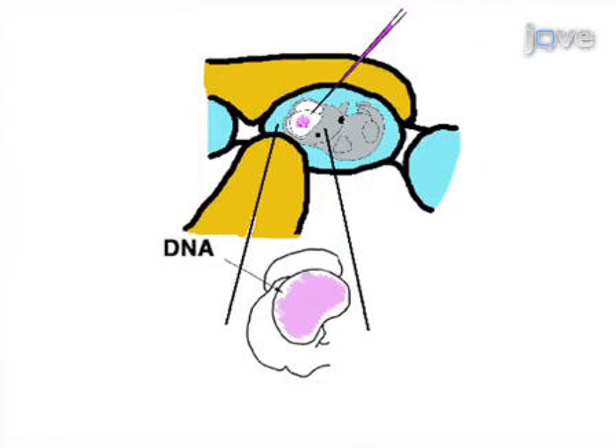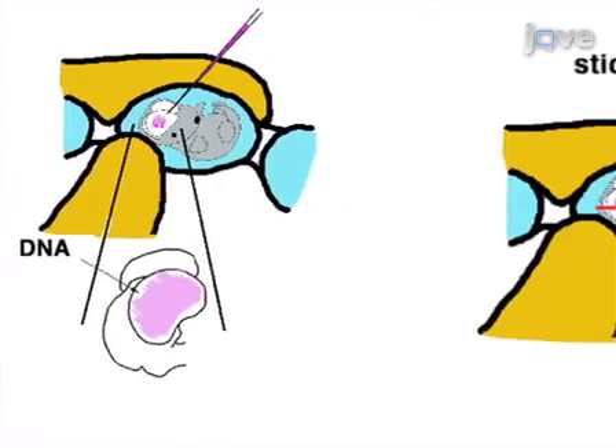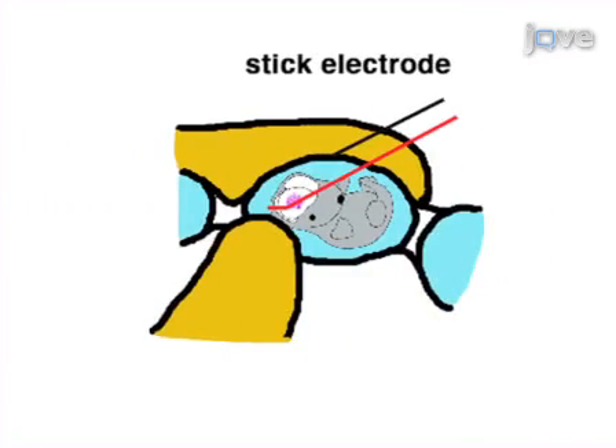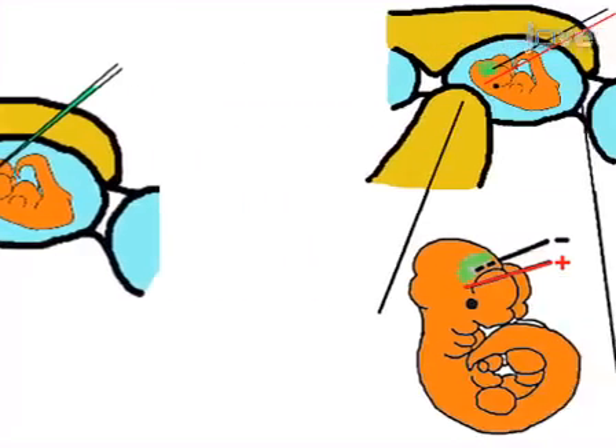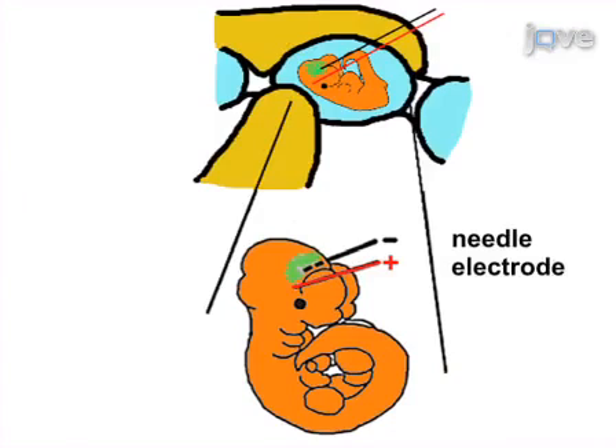The third step of the procedure is to perform electroporation with stick-type electrodes on the uterine surface in order to transfect DNA into superficial parts of the brain. The final step of the procedure is to perform electroporation with needle-type electrodes into deeper structures of the brain such as the thalamus and hypothalamus.